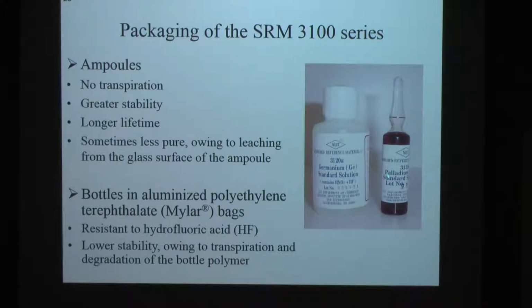But these solutions are generally themselves diluted down substantially from 1,000 ppm, 1,000 micrograms per gram, down to, say, low parts per million, 1 microgram per gram, 1 milligram per kilogram. That would be a 1,000 to 1 dilution of this solution.